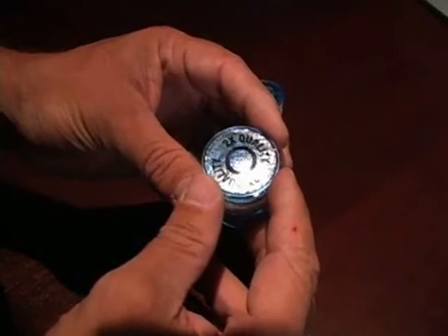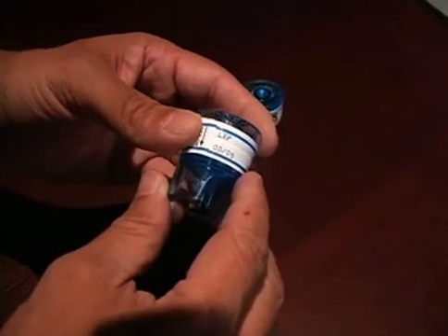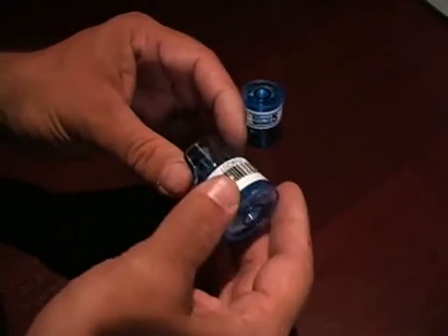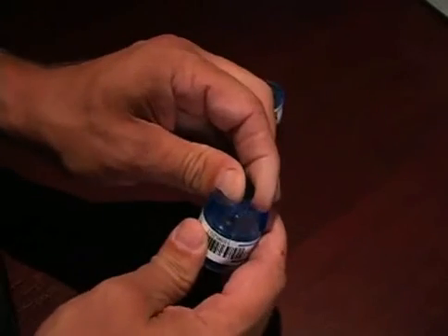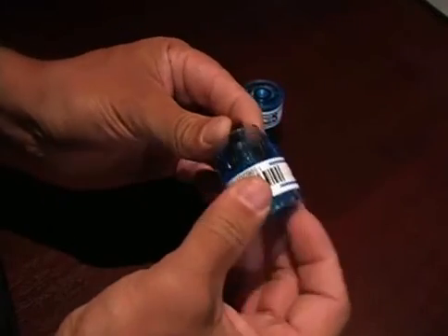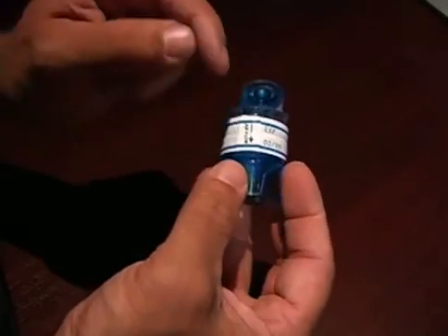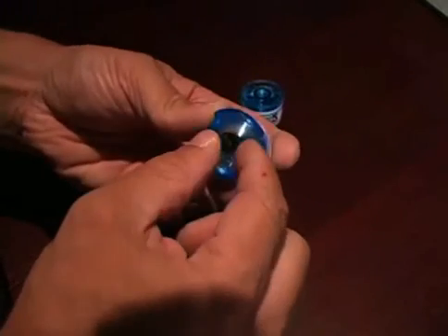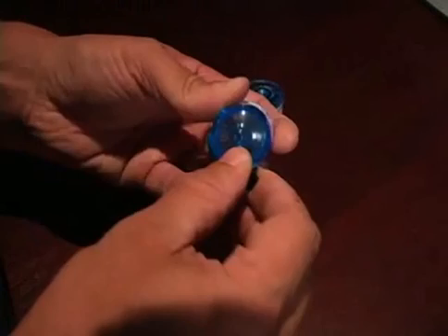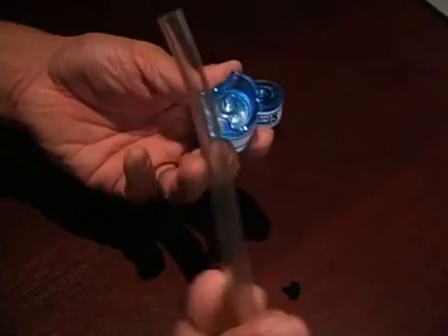So to work it, you simply remove the pin from the back, from the bottom. This is the bottom. Before I do that, let's confirm. We've got the airflow arrow. The top, air's coming in, airflow is going down through. Remove the pin. Connect one end of your tube. No adapters necessary. The tube can't be greater than 5 feet.